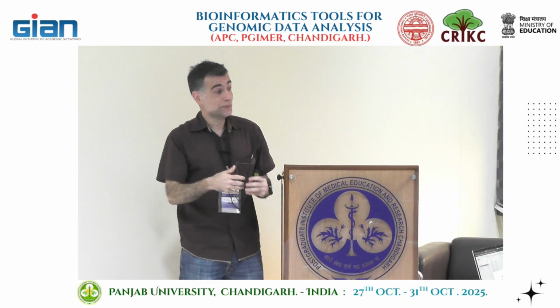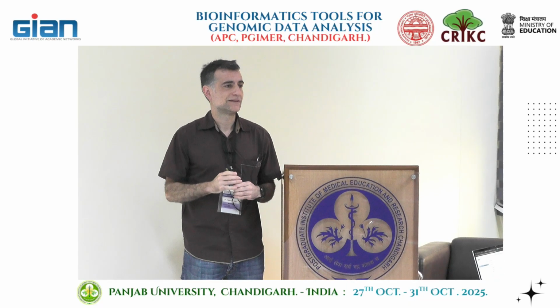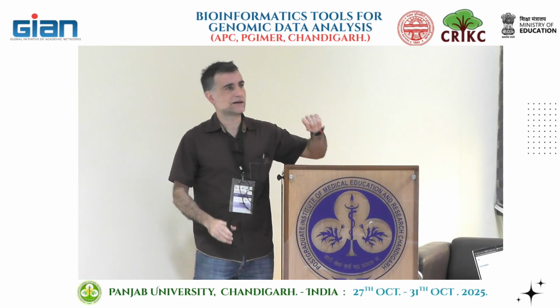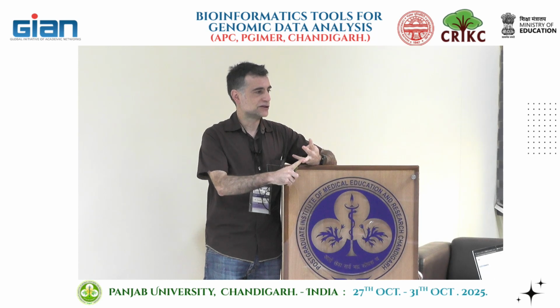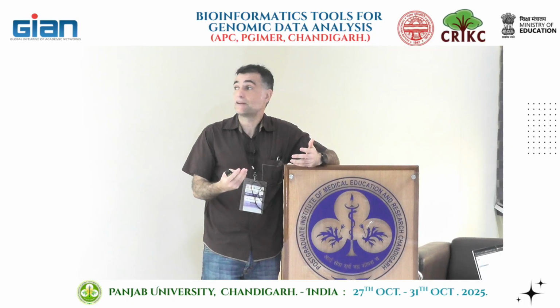But again, if you have a complex model, this table is going to be much bigger. An example we had yesterday was genotype, sex, and condition. This table will be much bigger. You generally wouldn't do anything.